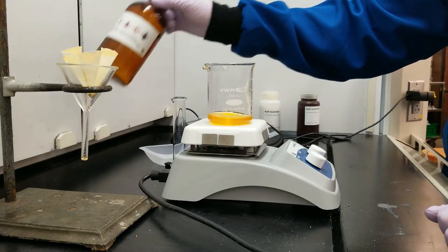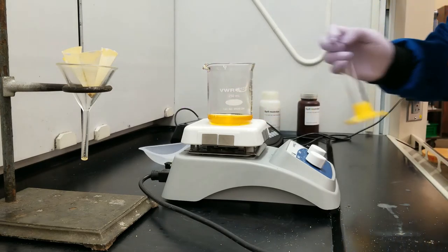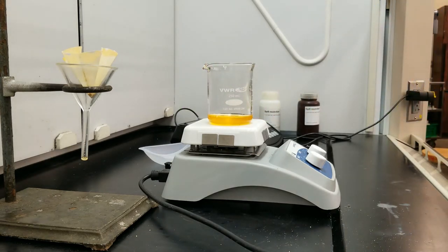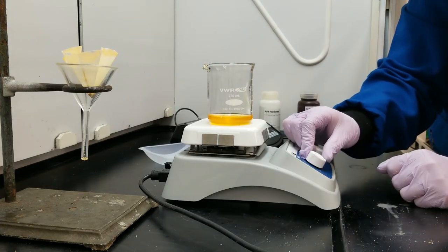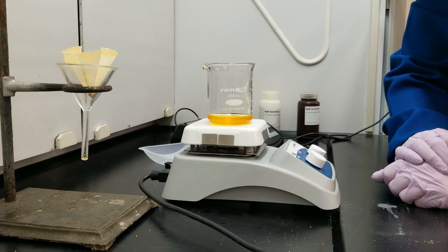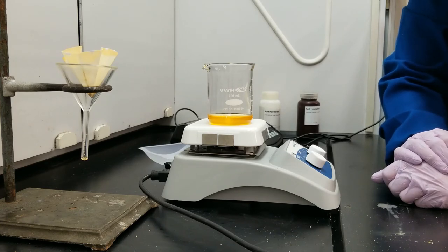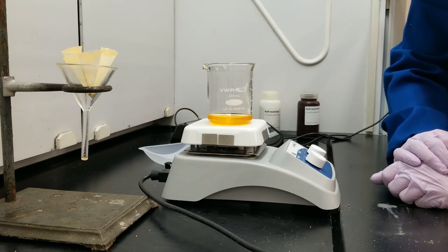Also, because hexane is very volatile, I'm going to take my reagent bottle away from my hot plate to decrease risk. So I'm going to turn on my hot plate and I'm going to dissolve this down so that the hexane is gone and all I have left is the fats.